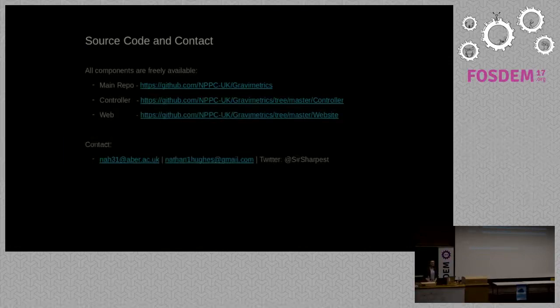Which sensors are at the moment deployed in your greenhouse? What sensors? In the greenhouse, there's a lot of sensors. So we'll have air humidity, air temperature, those sorts of sensors. In gravimetrics itself, in its pure form, all we have is load cells, and yeah, it's pretty much just weight we're focused on for sensing at the minute. But there's a lot of capacity to add and augment more on, depending on what an experiment will want to find out, really.